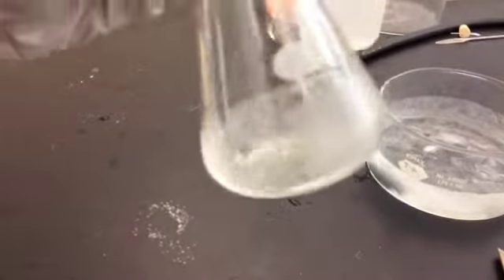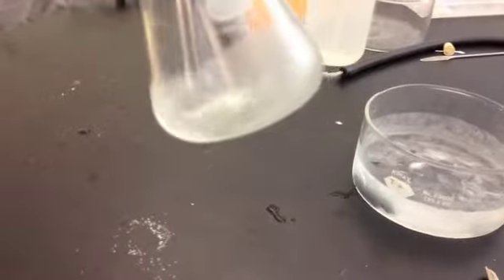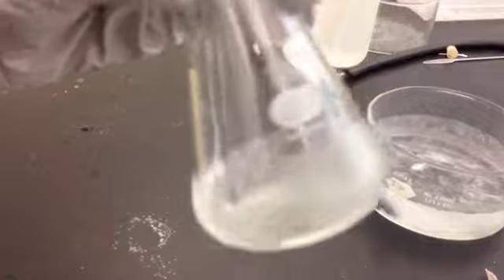So you just start scratching the bottom. Be careful not to break the rod or the flask because they're fragile. Once you scratch it enough, maybe for a minute or so, put it back on the ice bath and it should precipitate out.